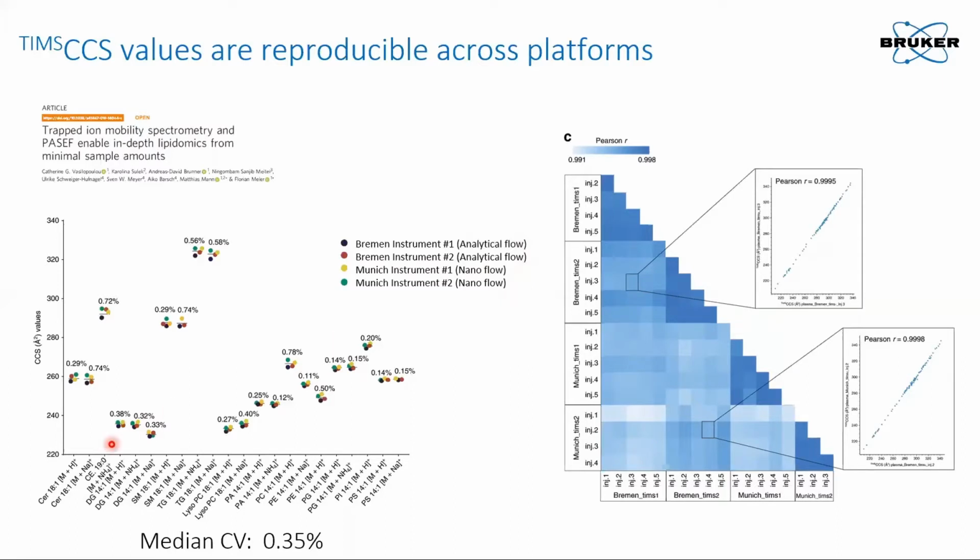And despite the 2 different methods of sample introduction, you can see here that for these different lipid classes, we have a very high reproducibility of CCS values.